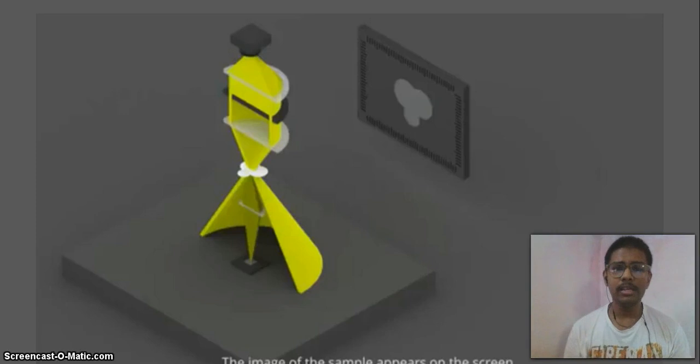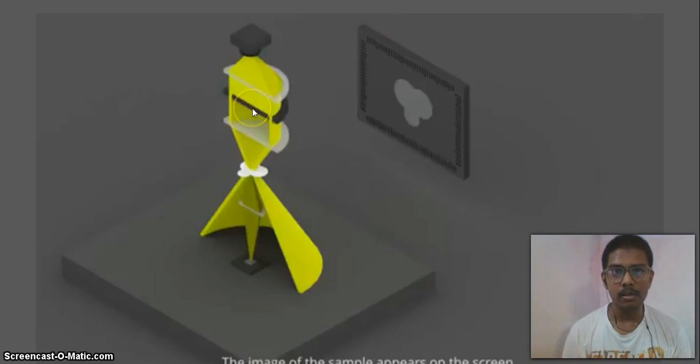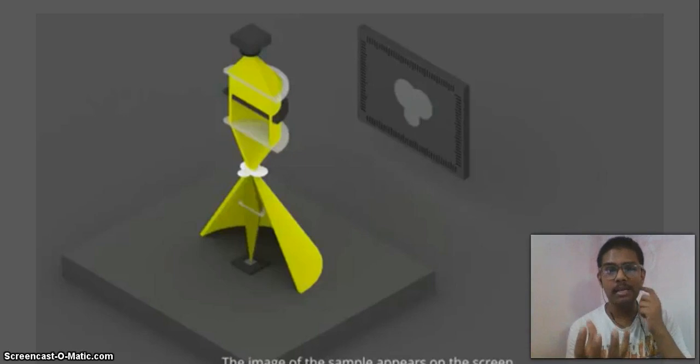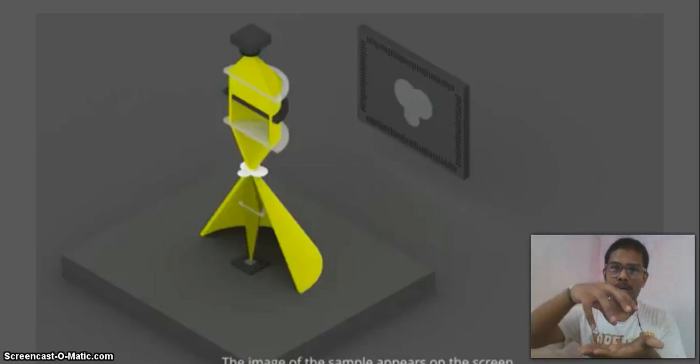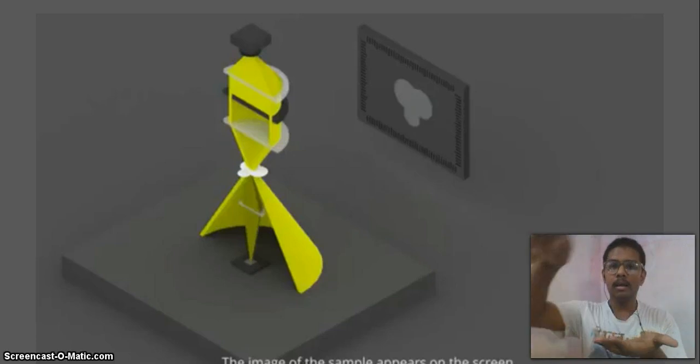Now everything is equal to the bright field microscopy, only they have used some special type of condenser lens. Their concept is that we want to remove the central region of the light. Here you can see the central region. There is light in the central and in the edge region also, but they are using a special type of opaque disc where you have a concentric circle. The inner circle is there, and you have a circular gap, and then another circle.